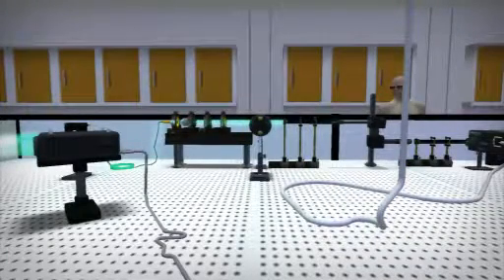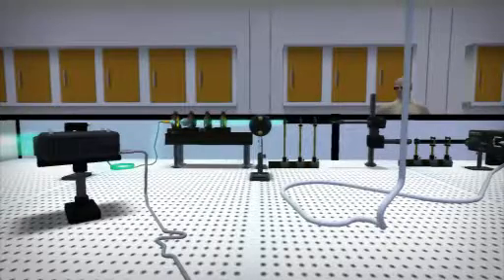As mentioned earlier, if protective goggles are removed, the risk of eye injury increases dramatically. A laser eye injury can cause serious permanent damage to your vision. This is an example of an eye injury caused by a visible laser beam. It shows the initial effect of a retinal burn to the central portion of vision. In the event of such an injury, please follow the emergency procedure outlined in your laboratory safety documents. Note that lasers can also cause damage to the skin.